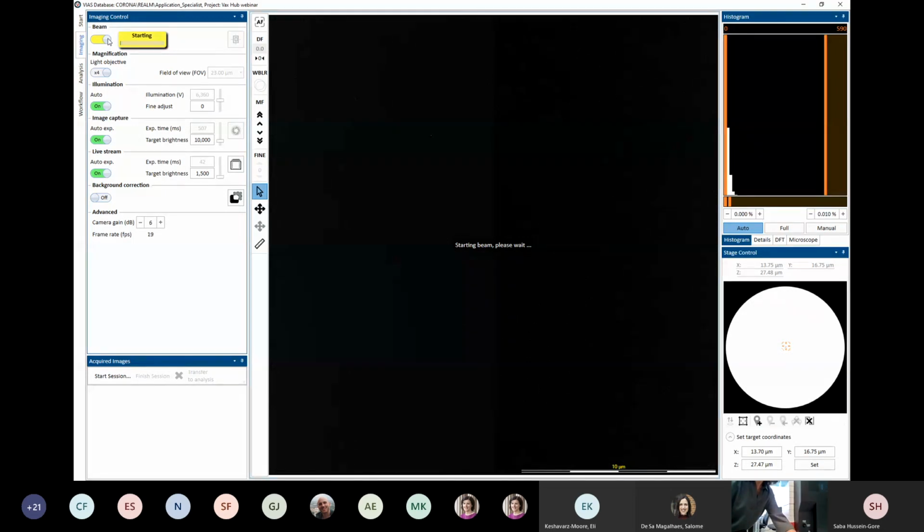I just want to show you what the MiniTEM looks like, just so you get a sense of it. I hope you guys can see this. This is another MiniTEM here, but this is the MiniTEM.